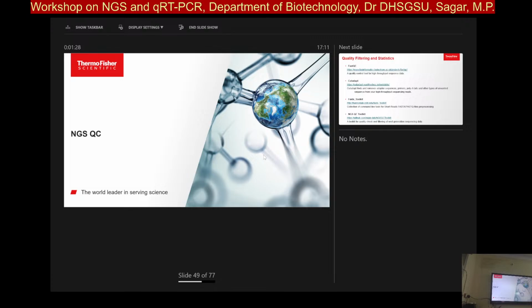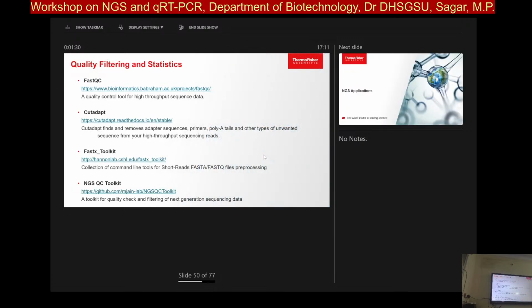so rather, what we have is the QC, since this is giving me an opportunity to go around. So, you can do this. I can't give you. It's not working. Still, it's okay. So, the opportunity is that once the data is generated, what can you do for it? How would you understand it? So, to understand it, you need to do a QC, right?